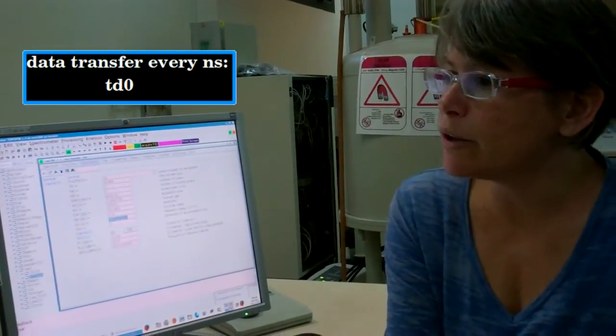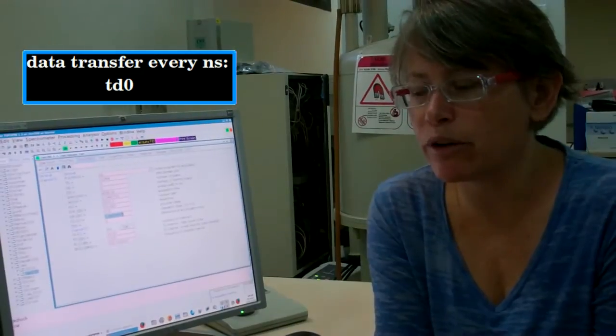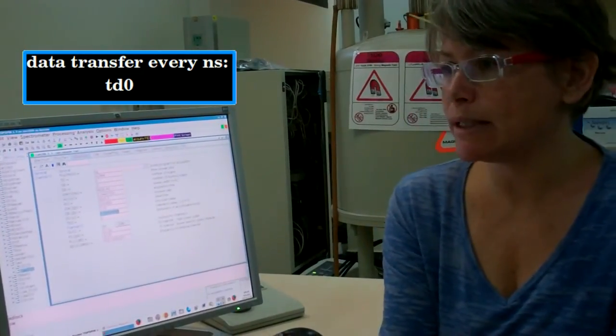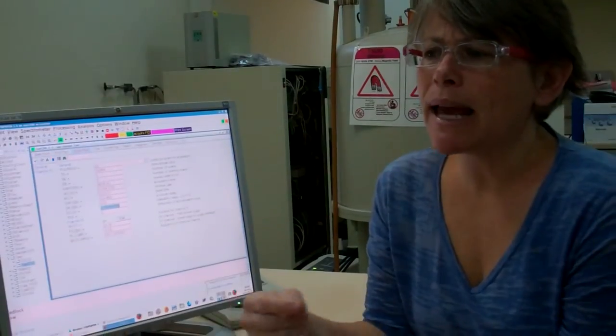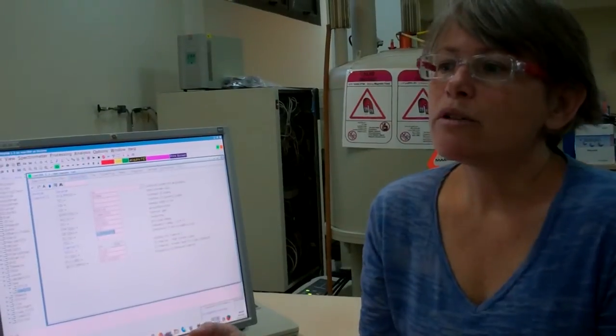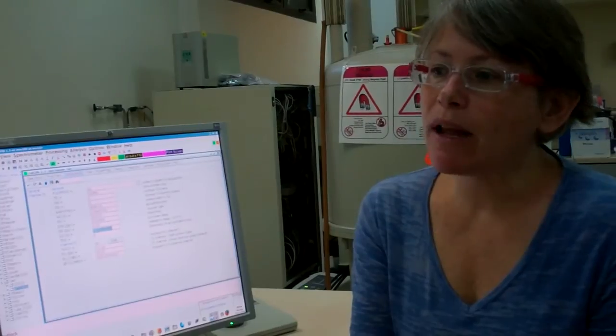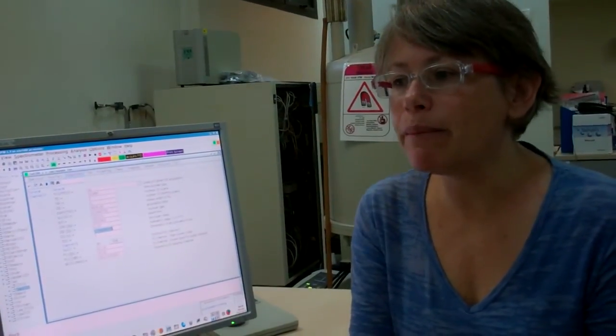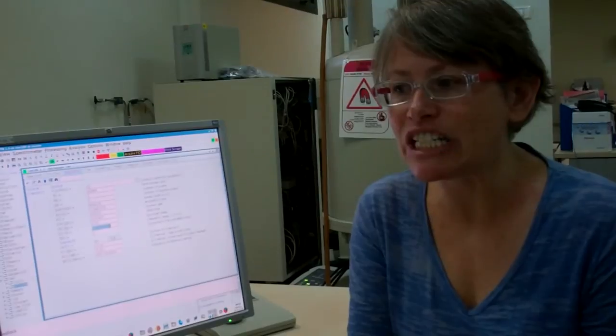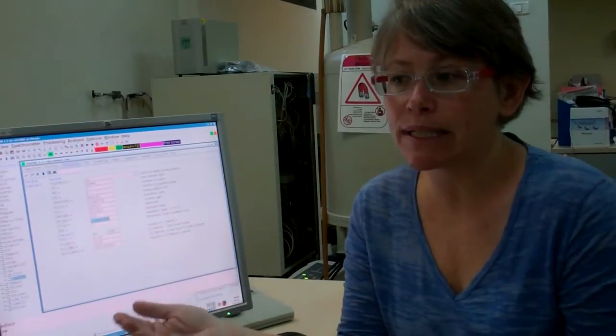TD0 is another loop that contains the NS loop inside it. Every NS, the acquired data will be transferred from the CCU in the cabinet to this computer where I'm sitting. If something happens to the computer connections before the data is transferred, it'll be lost. So if I'm running a very long experiment, I might want to transfer the data every so often, and I can do this using TD0. Another strategy is to collect blocks of data in different experiment numbers using a command called multi-ZG. If you use multi-ZG, then at the end you'll need to add all the different experiments together.